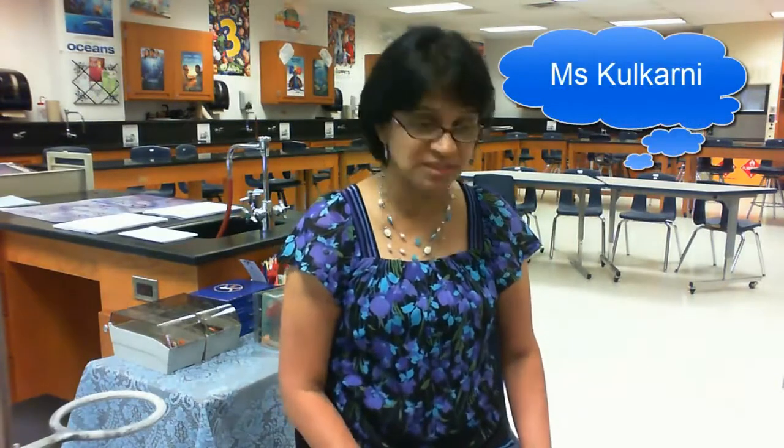I'm Sandy Kulkarni, and we are going to go over our lab equipment which we generally use. We need to remember certain equipment by names and what they are used for.